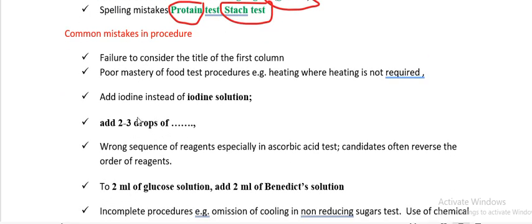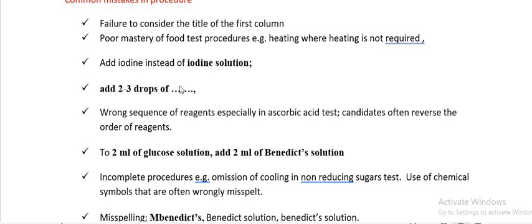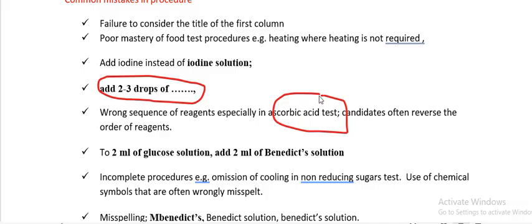Common mistakes in procedure: failure to consider the title of the first column, poor mastery of food test procedures, adding heating where it is not required — heating is mainly for non-reducing sugars and reducing sugars. Write 'iodine solution,' not just 'iodine,' since iodine comes in different forms. Avoid '2 to 3 drops' — be specific. Wrong sequence of reagents is also common, especially in the ascorbic acid (vitamin C) test, where candidates reverse the order.